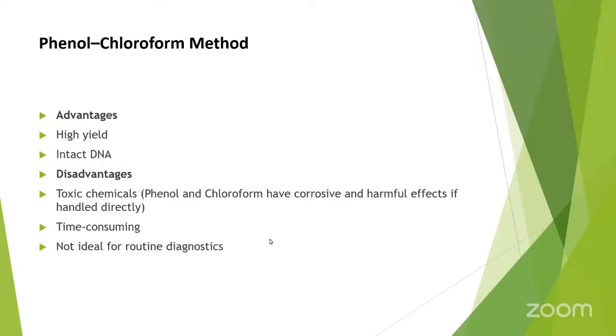The disadvantage of it is that these chemicals are toxic. They have a corrosive and harmful effect if handled directly. It is also time consuming and not ideal for routine diagnostics like in our laboratories. Most of our laboratories are for routine diagnostics.